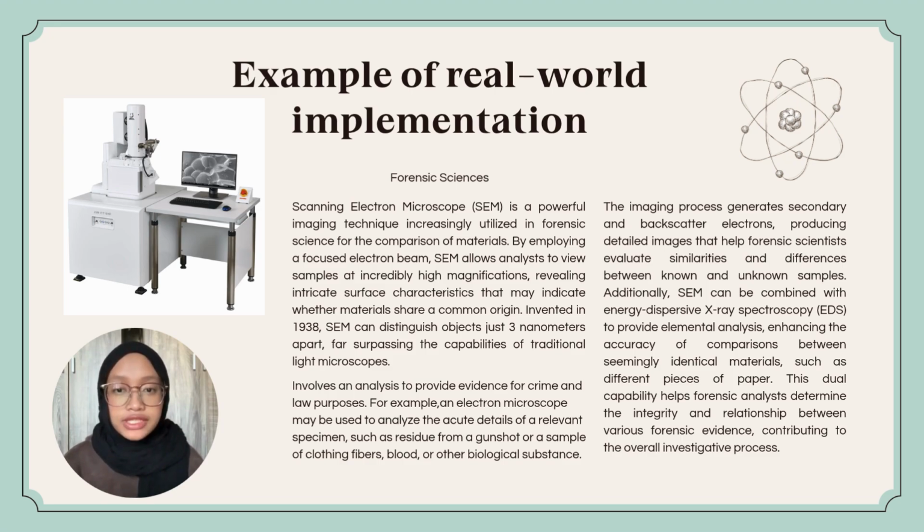First of all, in forensic science, the scanning electron microscope is a powerful imaging technique increasingly utilized for the comparison of materials. By employing a focused electron beam, SEM allows analysts to view samples at incredibly high magnifications, revealing intricate surface characteristics that may indicate whether materials share a common origin.